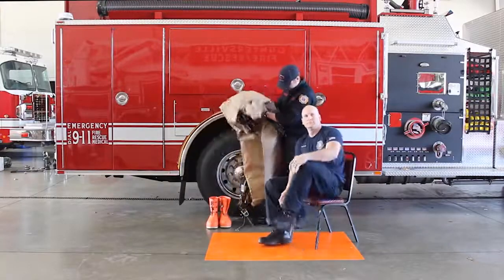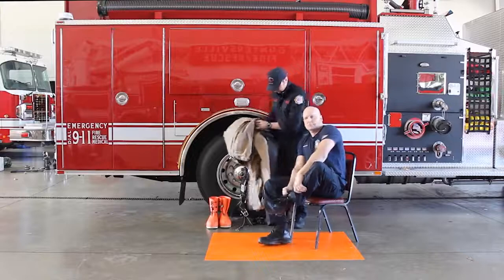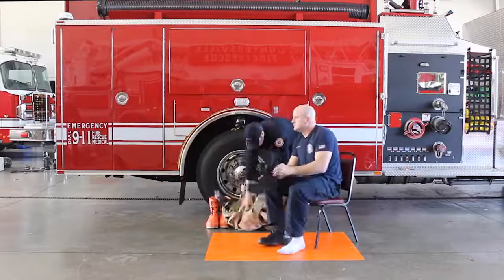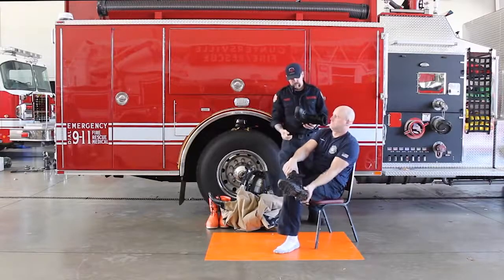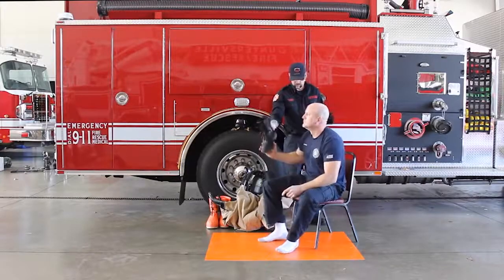Remove shoes. The sock boots on this garment are worn inside the outer chemical boots. These sock boots do not have adequate durability or slip resistance to be worn over footwear as an outer covering.